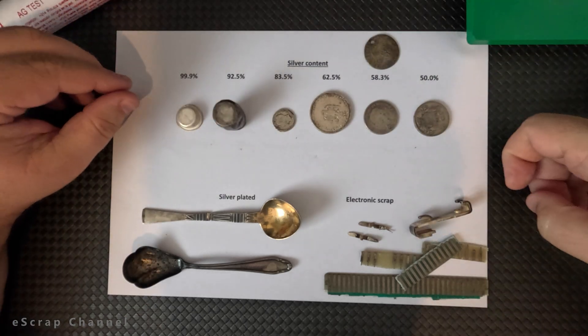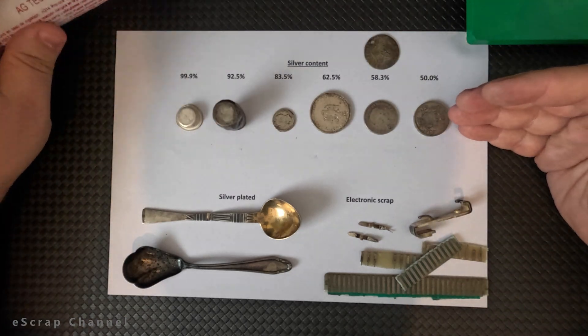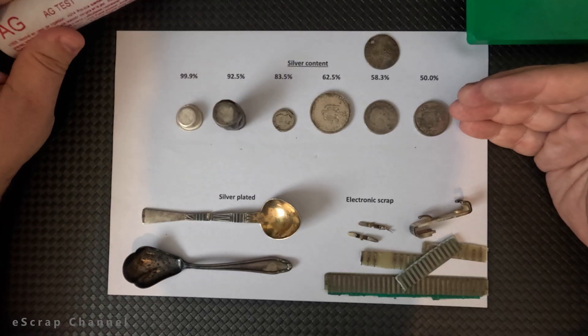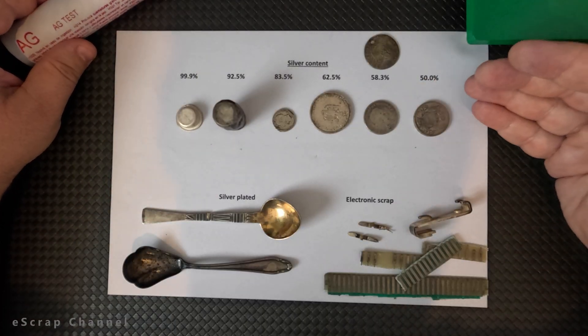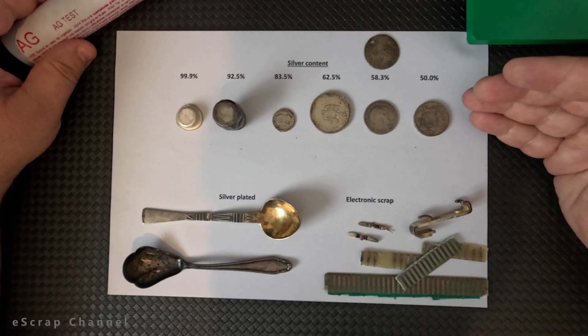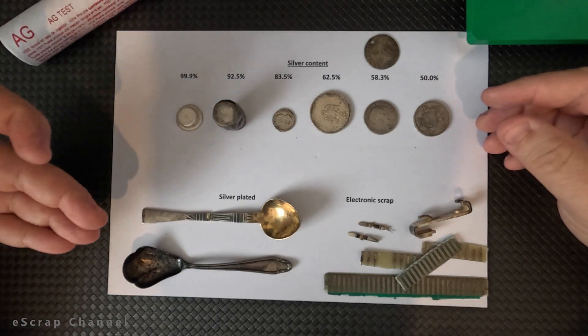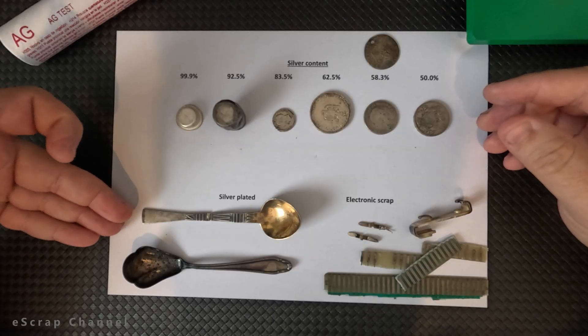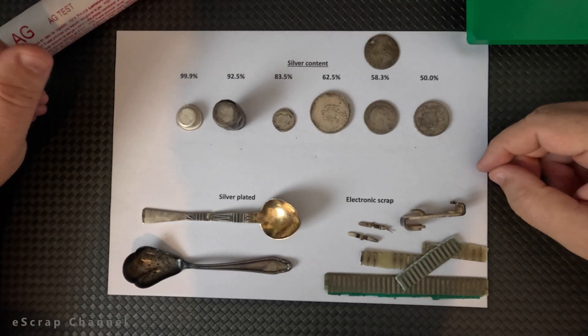In our case I will do a couple of experiments. First, I will check how this silver testing solution works on silver objects with different percentage of silver from 100% to 50%. Then I will show you how to use it for silver plated objects and at the end I will show you how to use it on electronic scrap.